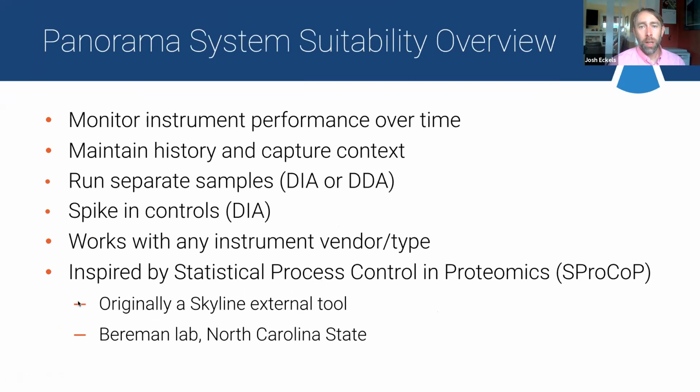So Lindsay gave a great overview of system suitability in general. I will caution you that I am a little bit less rigorous in my separation between system suitability and QC, and you'll see that reflected in some of the Panorama user interface as well. I think we're thinking about getting a little more in sync with Sue's definitions, but just keep that in mind as I show screenshots and so forth here.